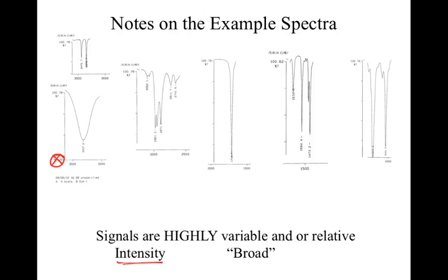Okay? Next big thing to note would be the term broad. Okay? Broad or narrow peaks. In particular, you take a look at the NH. The NH example that I gave you showed two very sharp peaks. Okay? The reason that I used that example is that's the one I had. So I had to work with that.